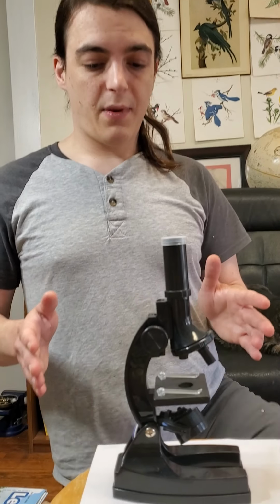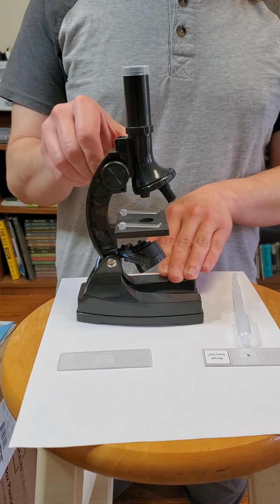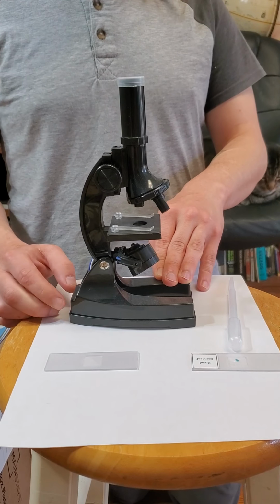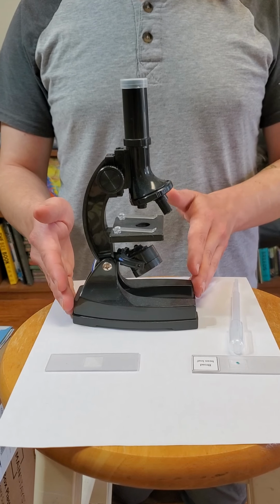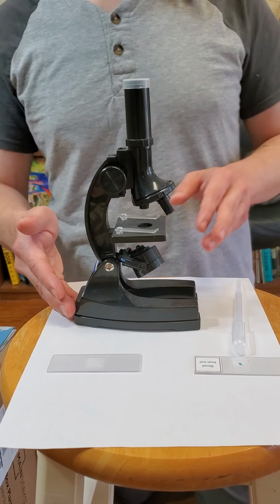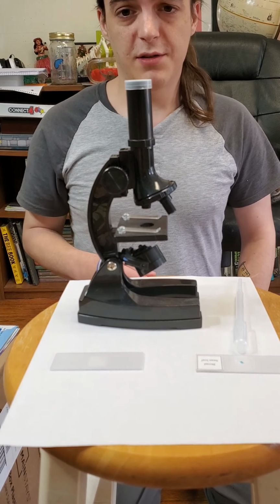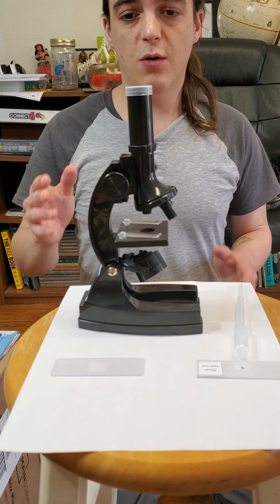So right here, we've got your basic microscope setup. This is called an optical microscope. As we learned with Miss Catrone when we were doing listening and learning, these were invented by the Jansens, the brother and father. Really cool inventions.